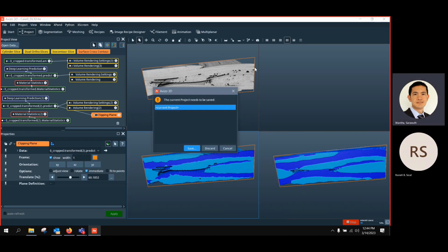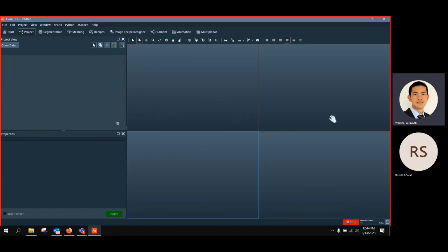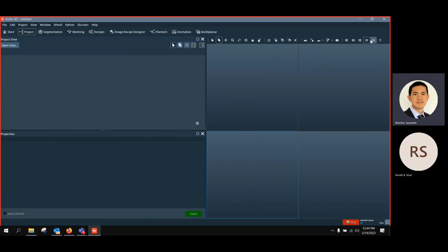So then we'll move to the new section. Yes. So for 2D, we had to prepare the training. Yes. And we did it by segmenting by hand. Yeah. With a pen or with a mouse. And yesterday we tried to segment in 3D with interpolation. Exactly. And it was not precise.